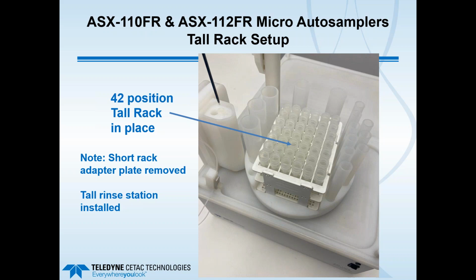Also notice that in this case, and I'll show you some details of this towards the end of the presentation, a different rinse station is installed, which is just below the sample probe. Also around the outside of the carousel tray, you see the taller standard vials, the 30 ml and 10 ml PFA vials.